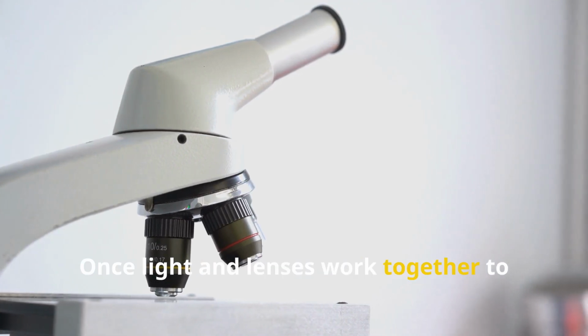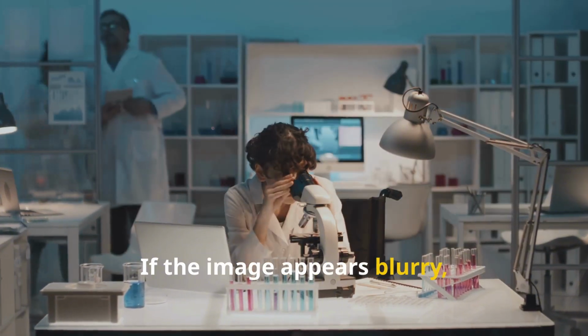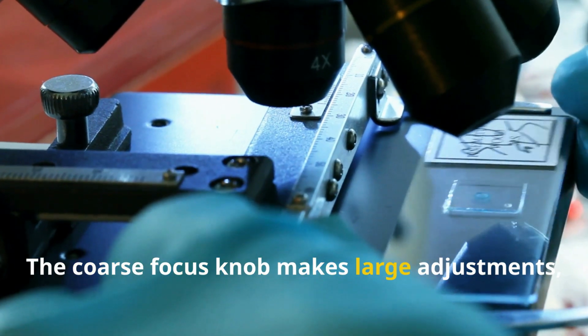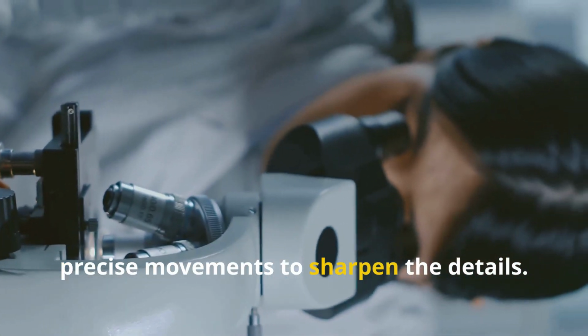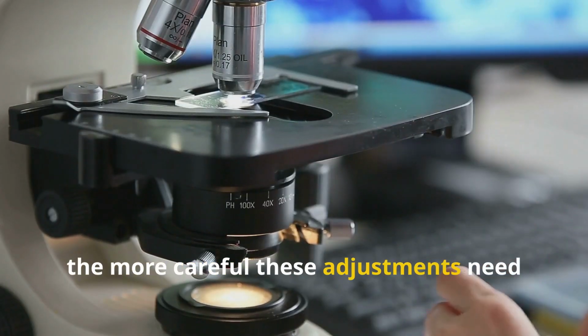Once light and lenses work together to create an image, we need to focus it. If the image appears blurry, it means the lenses are not aligned properly. This is where the focus knobs come in. The coarse focus knob makes large adjustments, bringing the object into view, while the fine focus knob allows for precise movements to sharpen the details. The higher the magnification, the more careful these adjustments need to be.